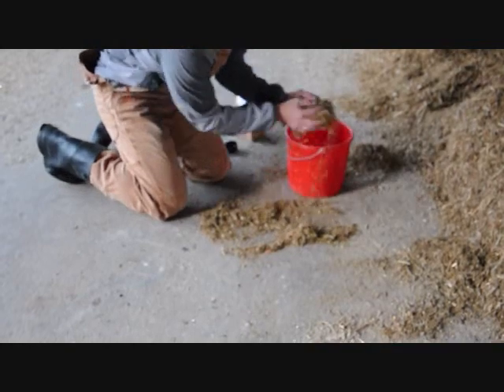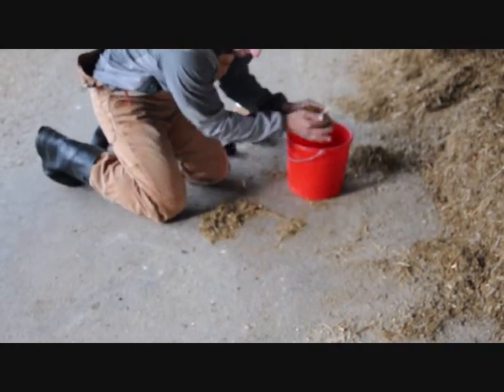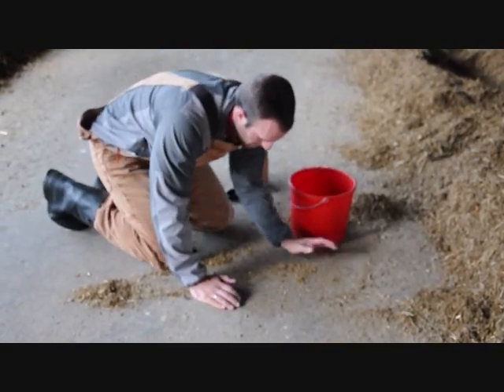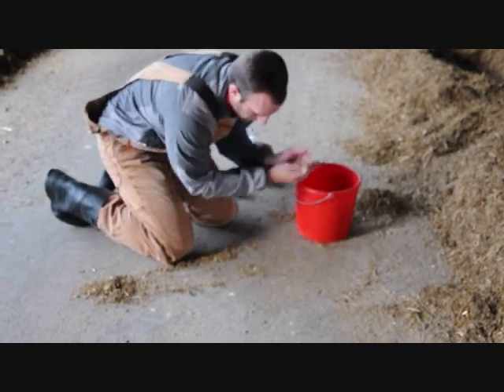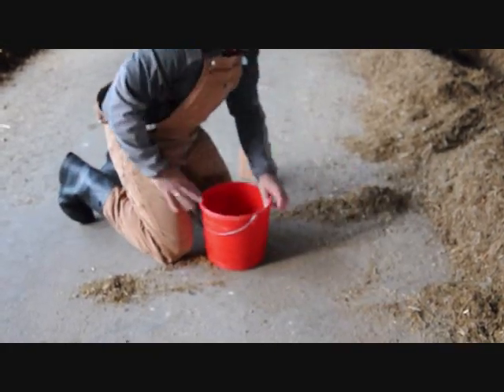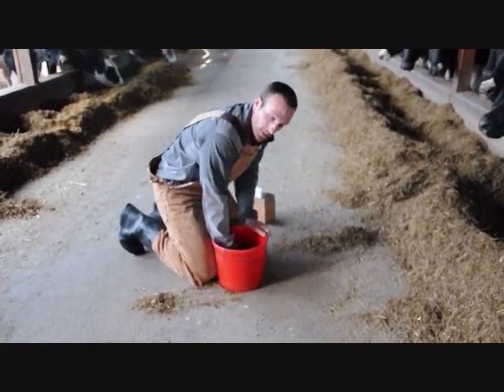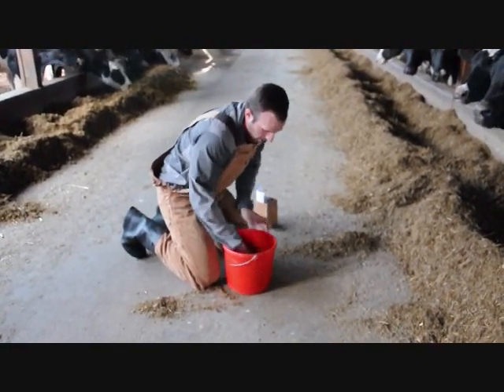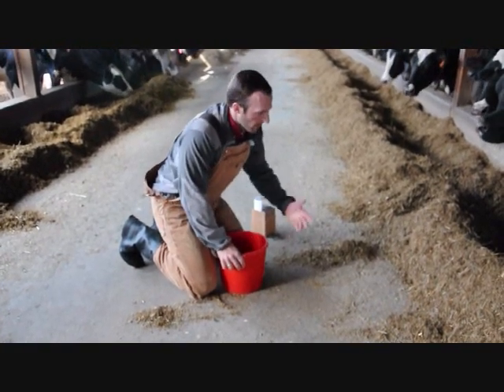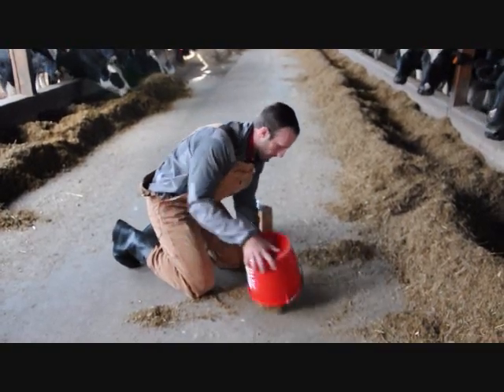Now we're going to put the entire subsample back in the bucket. We'll do the same thing again until our sample is small enough for about a one-quart bag, roughly a pound. We'll do about two times mixing and quartering. If we take five hand samples, it might take three times. If we take more samples — say a 100, 200, 300 cow pen — we might have to take more samples to accurately represent the feed.